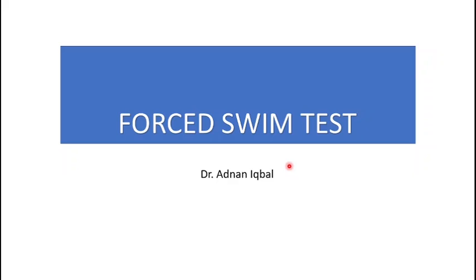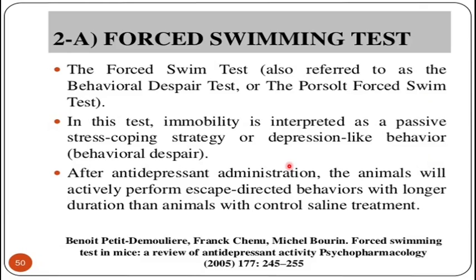In this video, we are going to talk about the forced swim test. The forced swim test is a behavioral test for rodents like mice and rats. In this test, we find out the depressive-like behavior in rodents.